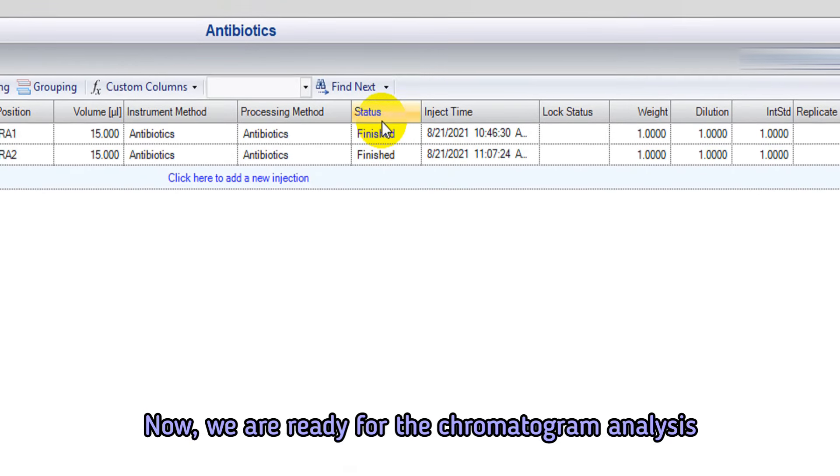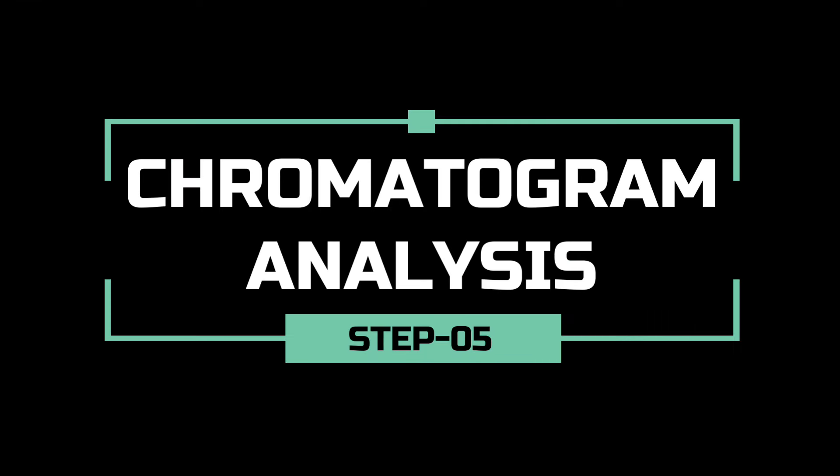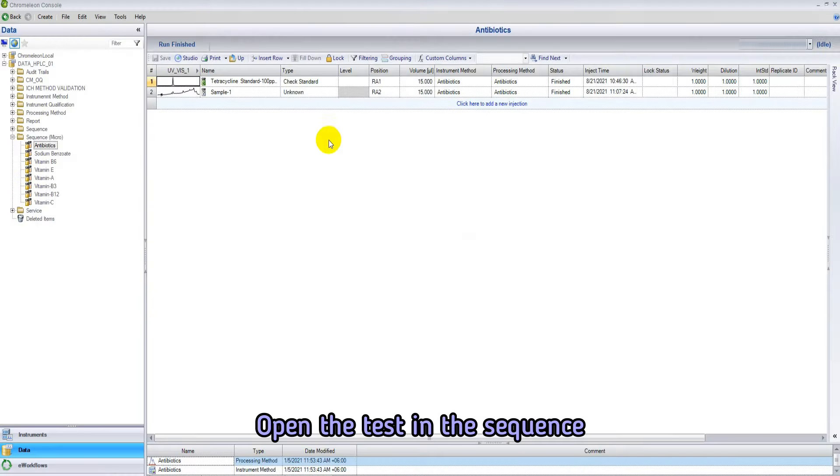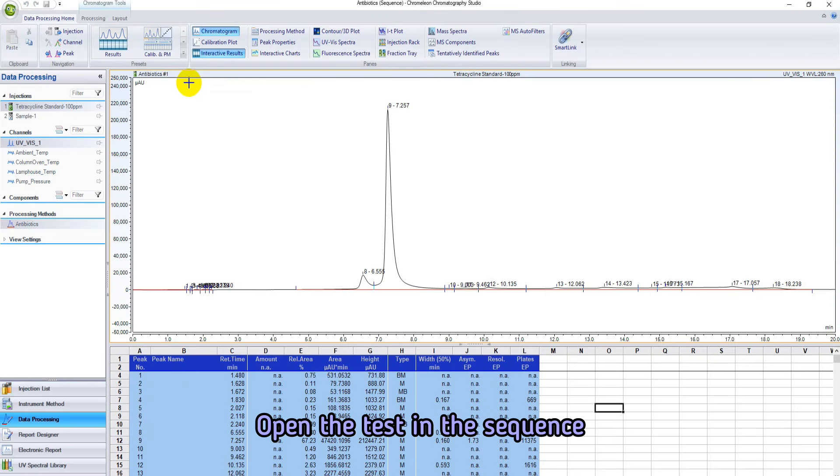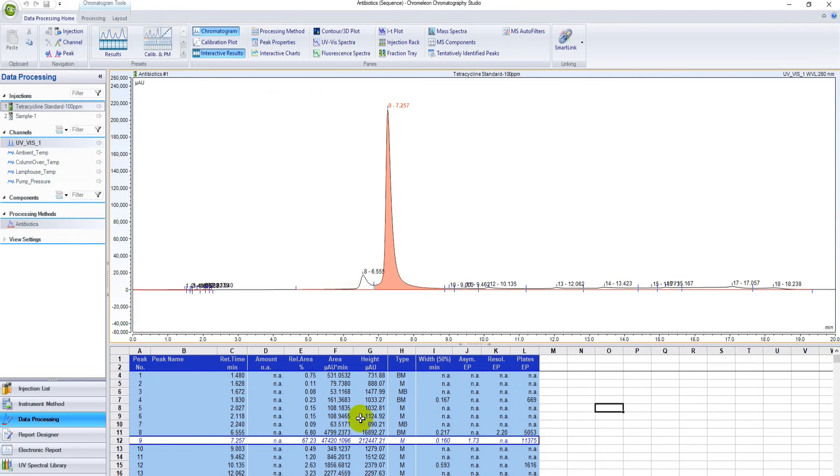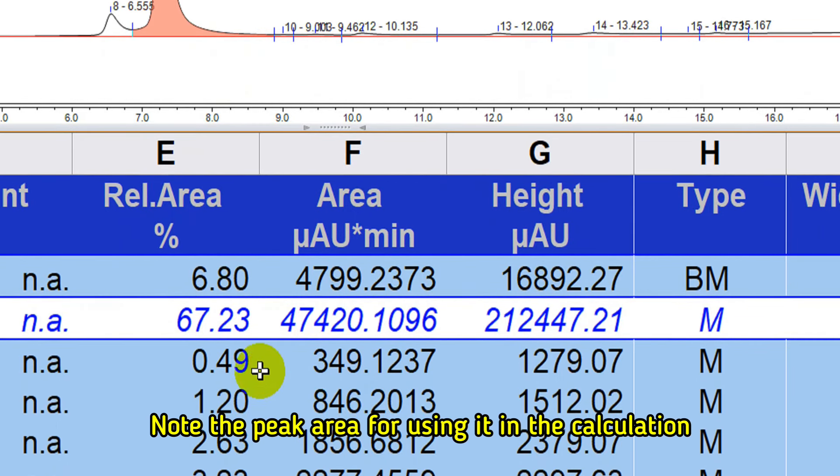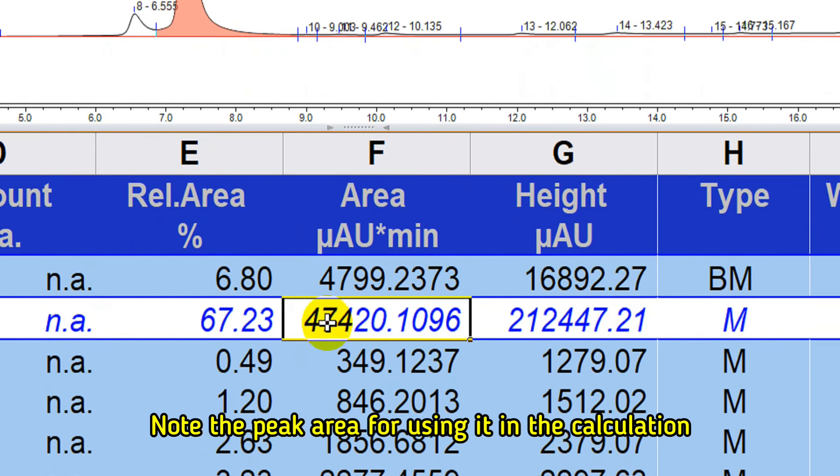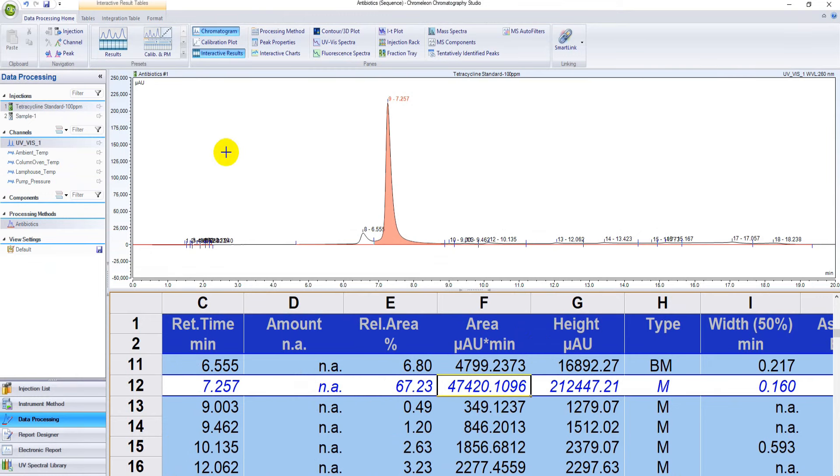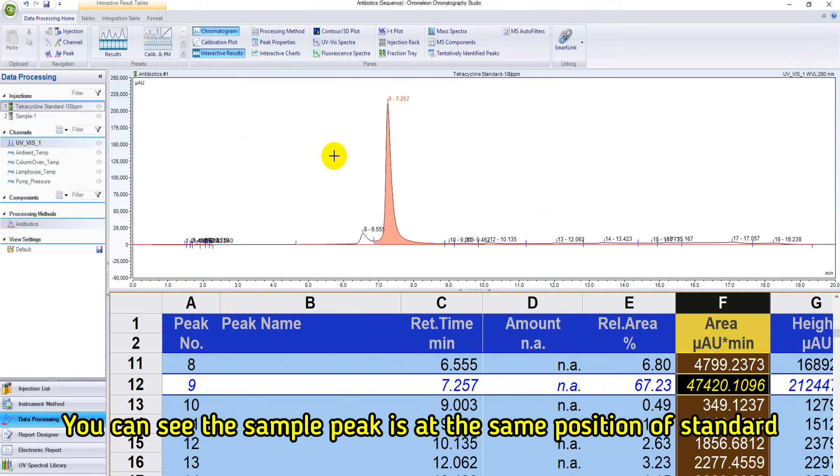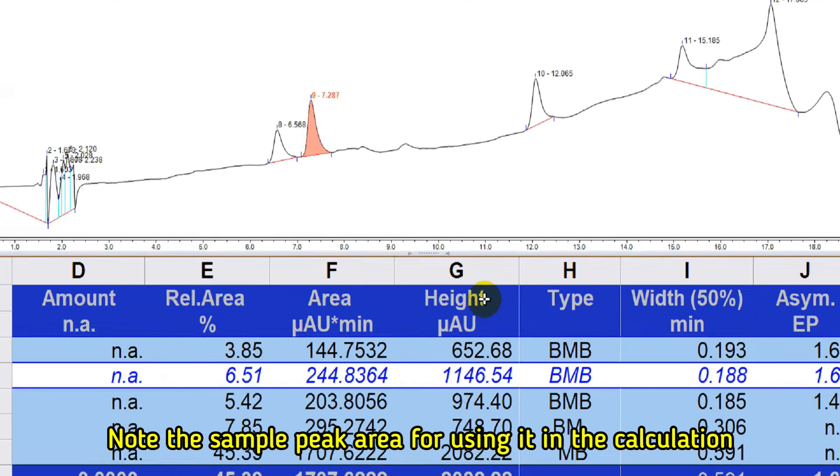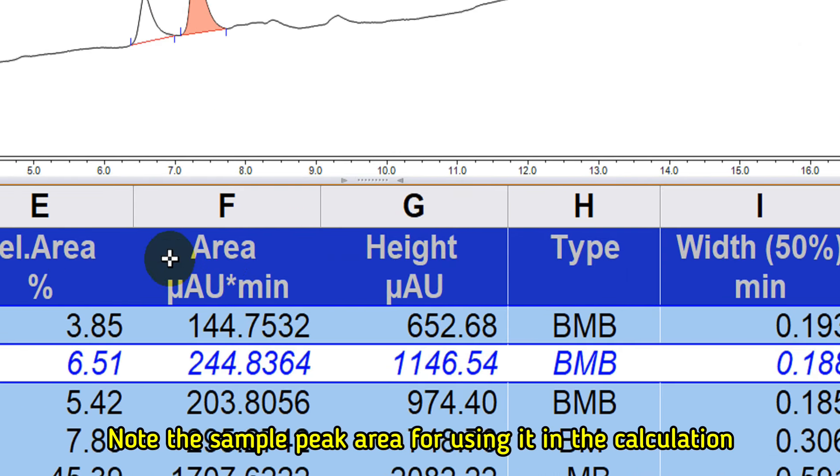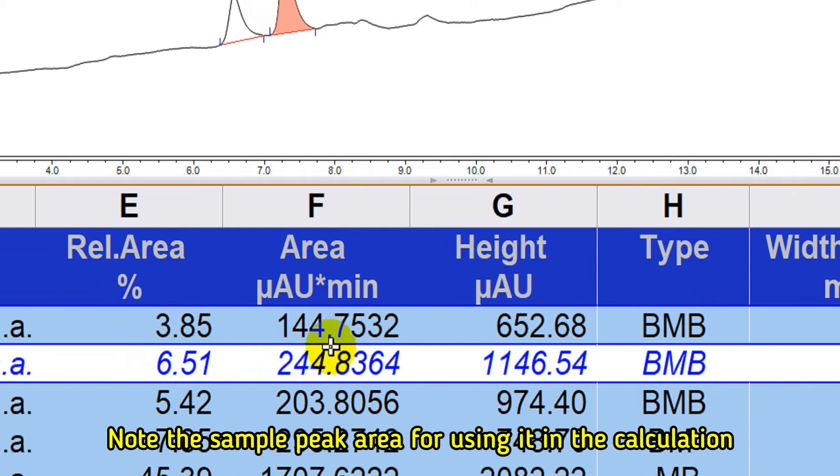Now we will analyze the chromatogram of tetracycline analysis. Open the chromatogram of tetracycline standard. You can see the peak of tetracycline 100 ppm standard at 7.2 retention time. Note the peak area of the standard. You can see a small peak in the sample at the same retention time 7.2. So this peak should be considered as tetracycline because the retention time is the same as standard. Note the peak area of tetracycline in the sample.